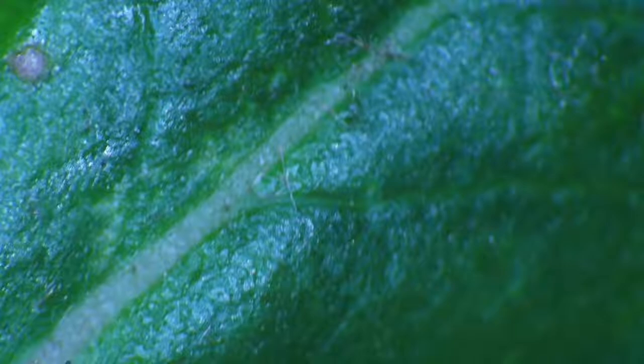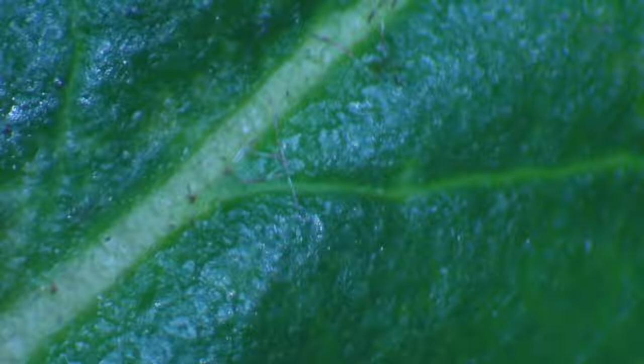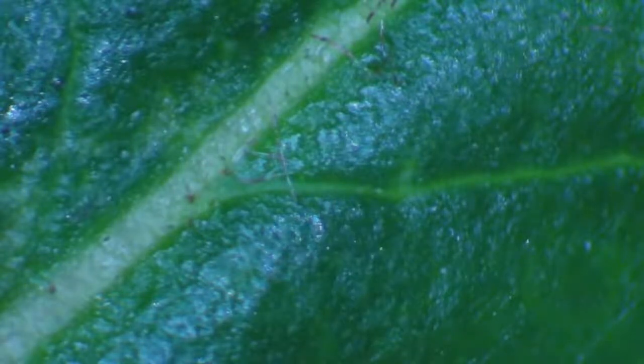Let's turn on the backlight. It's pretty thick, so it didn't change that much. Dramatic if I zoom in and turn it on and off. And there's the hair on the plant there. It's kind of woolly on the stems. Sometimes you get insects stuck in there.